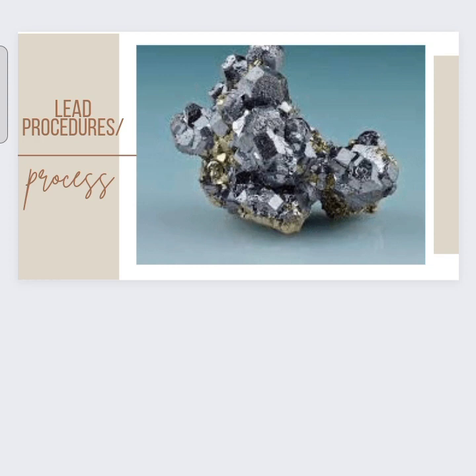Lead procedures or process. Lead oxide is an important component of the flux material used in the fire assay process to aid in separating target precious metals from the ore. The greatest sources of inorganic lead exposure occur from the release of airborne particulates when mixing flux material and firing cupels.